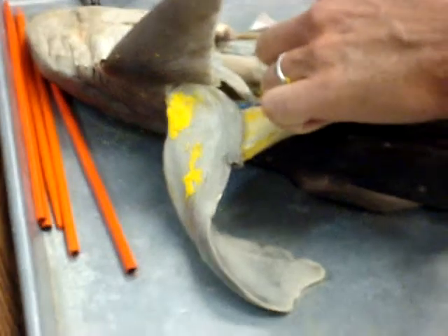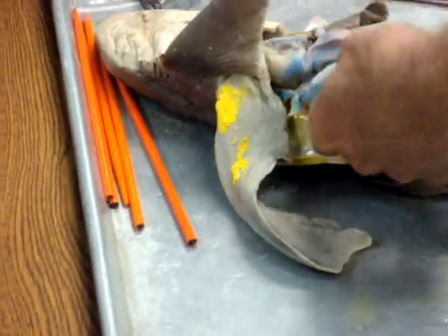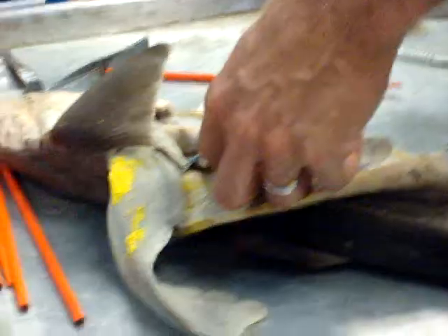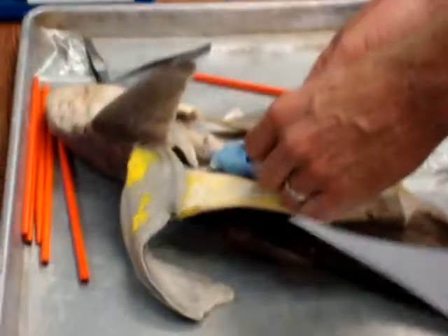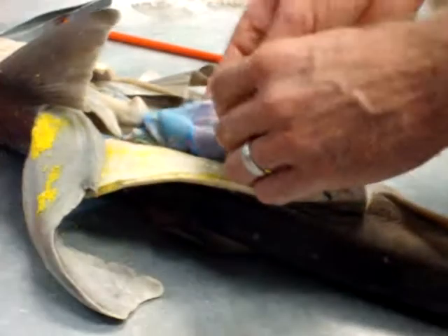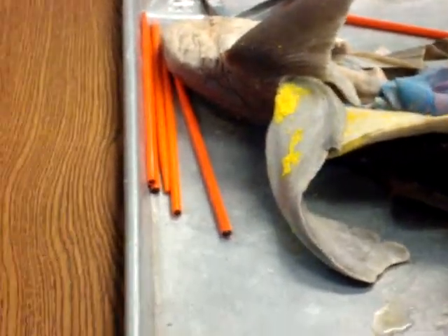U-shaped area here as you transition from the stomach into the small intestine. Which one? I don't think it's the duodenum. I can't really find it. The duodenum isn't actually labeled. It's all right. The stomach right there. Below the stomach, you can see it up on the board, but this is the pancreas. Okay, the pancreas does help in digestion by secreting digestive fluids into the stomach through the pancreatic duct. Is that what they call it on there?